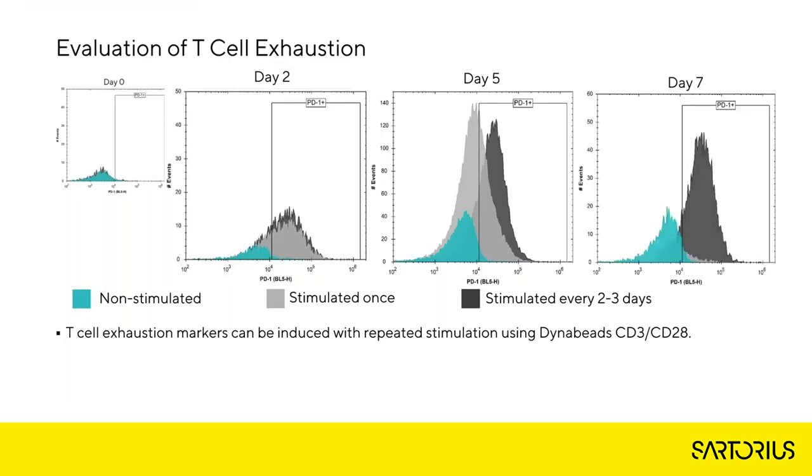Finally, at day 7, the single stimulation returns back to non-stimulated levels, while the repeat stimulation sees sustained expression of PD1.